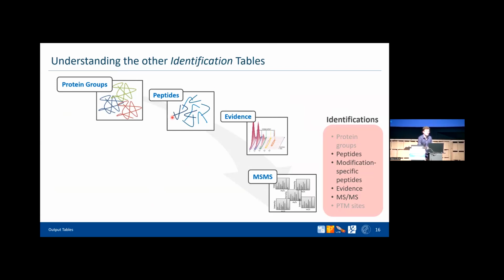If we want to understand the other stuff, we have to look again at how our mass spectrometry-based proteomics works. So what do we have here? What do I mean by evidence and so on? We heard it a lot now: we have these protein groups, and proteins are digested. So actually we have peptides in our data, or actually we don't have peptides, we just have these funny three-dimensional plots of mass over charge ratio to retention time. And then there are these funny little peaks, which maybe you remember from Monday, a picture that Pili showed.